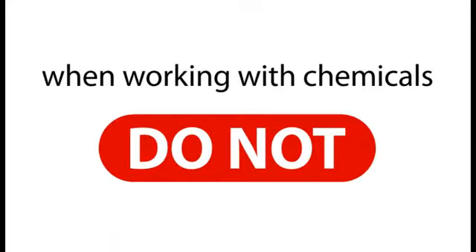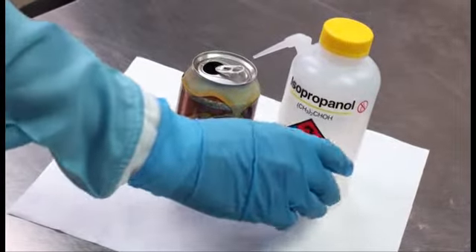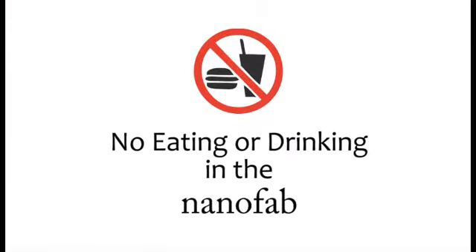When working with chemicals, do not taste, smell, or touch any of them. Also, eating or drinking in the nanofab can cause you to accidentally ingest dangerous chemicals. No eating or drinking ever in the nanofab.